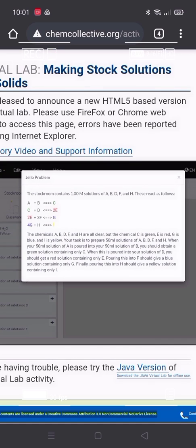So basically we have four colors that we need to accomplish. The task will be to prepare 50 ml solutions of A, B, D, F, and H. When you pour 50 ml of A into the 50 ml solution of B, you should obtain a green solution containing only C. When this is poured into your solution of D, you should get a red solution containing only E. Pouring this into F should give a blue solution containing only G. Finally, pouring this into H should give a yellow solution containing only I.